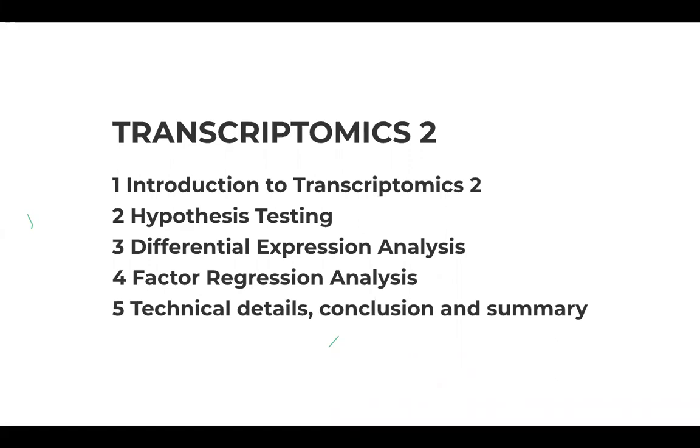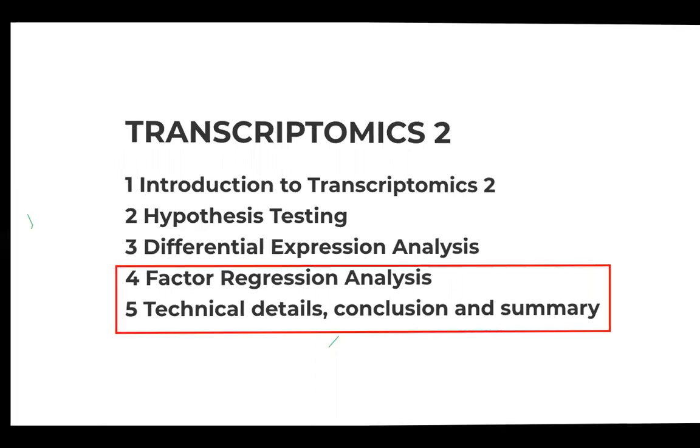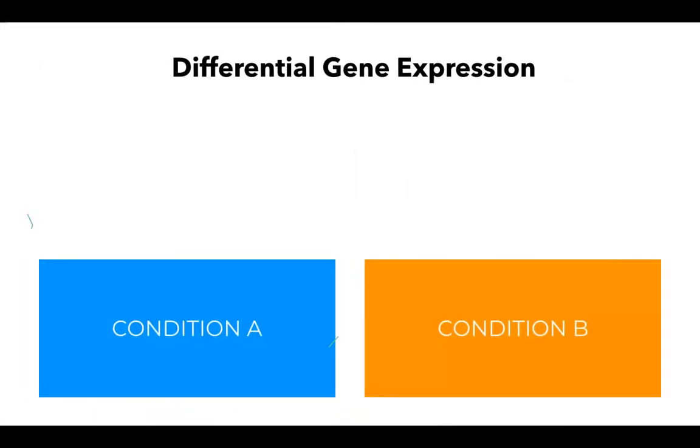So in this class, we will do factor regression analysis and the technical details involved within it, and we will understand how the differentially expressed genes are looked into.